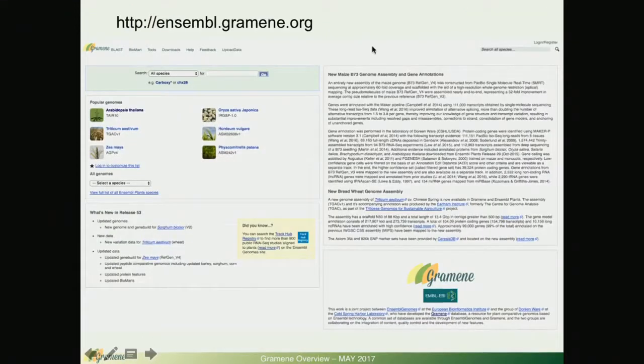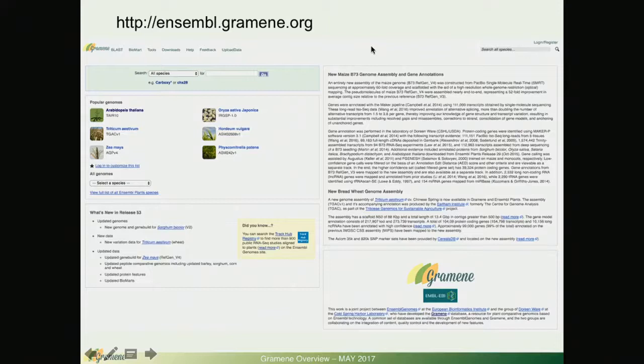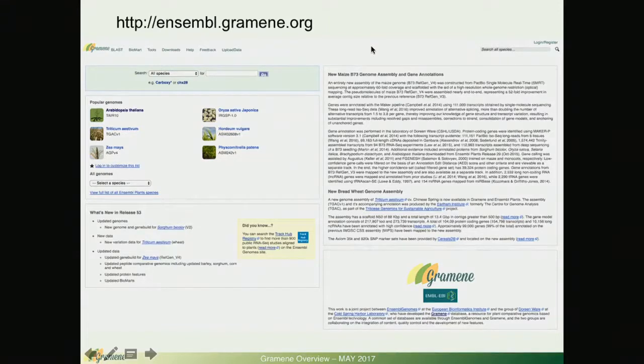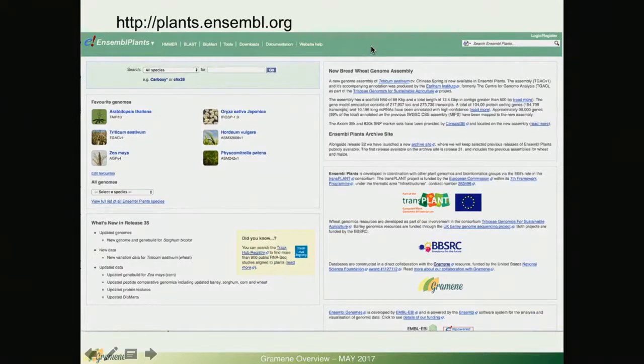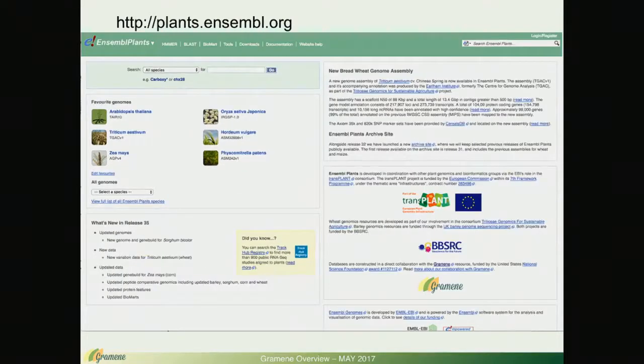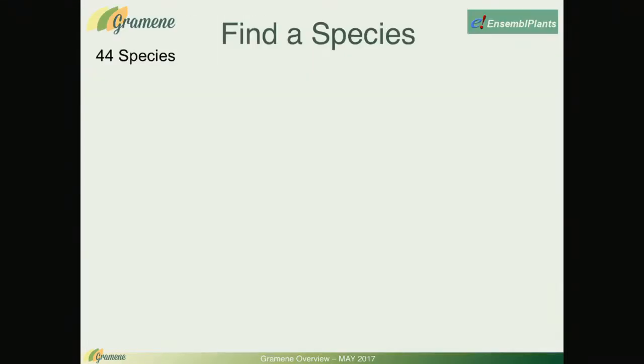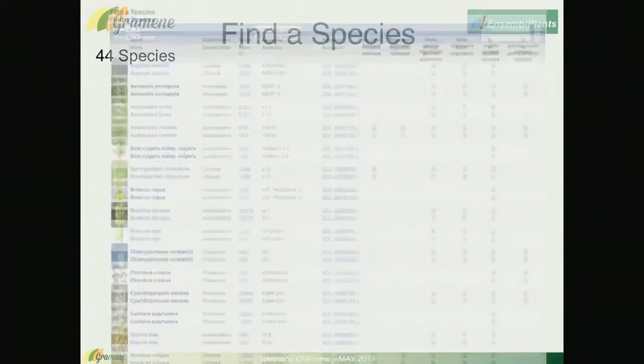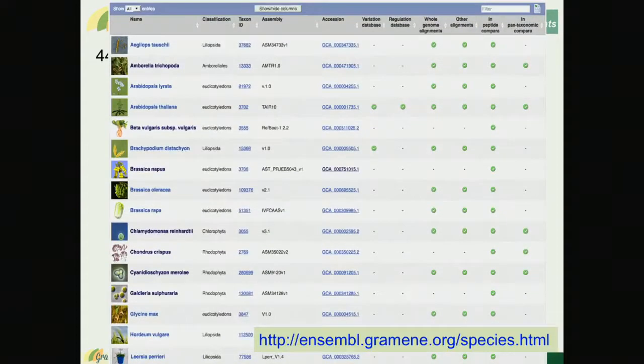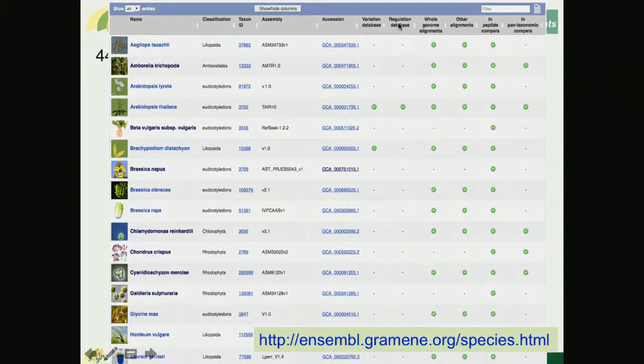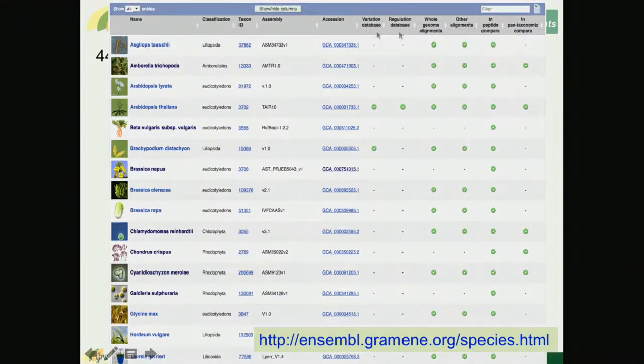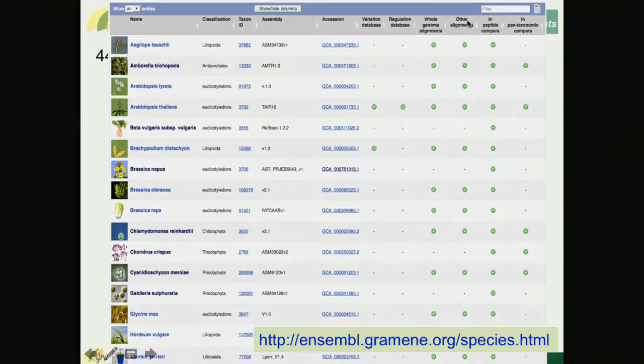Just to remind you, the Ensemble browser is a collaboration between Ensemble Plants and Grameen. We share very similar interfaces. Our 44 species, this is a nice table which summarizes the type of data that we have for each of these genomes: the variation database, regulation, whole genome alignments, other kinds of alignments, peptide Compara and pan-taxonomy Compara.